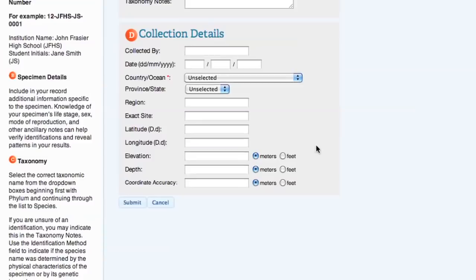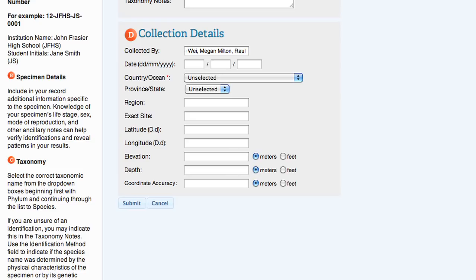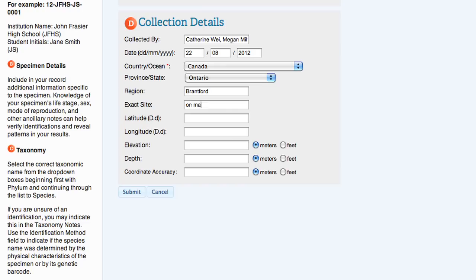The collection details section contains fields for all of the relevant collection information, such as who collected the sample, the date the sample was collected, and the region and exact site. Latitude and longitude must be entered in decimal degrees format. The elevation, depth, and coordinate accuracy can be entered in either meters or feet.